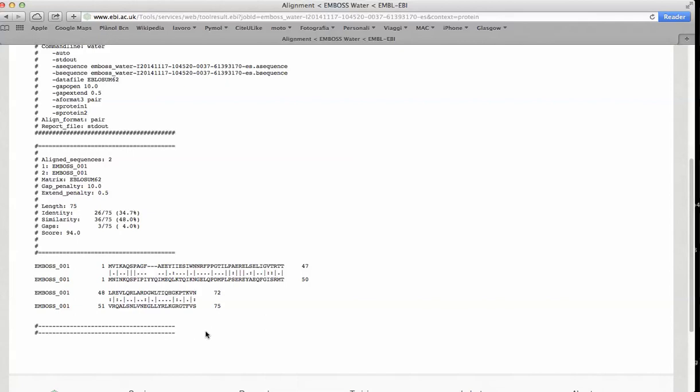These two sequences are transcription factor regulators that bind to the DNA. And this is the region involved in the binding of the DNA.